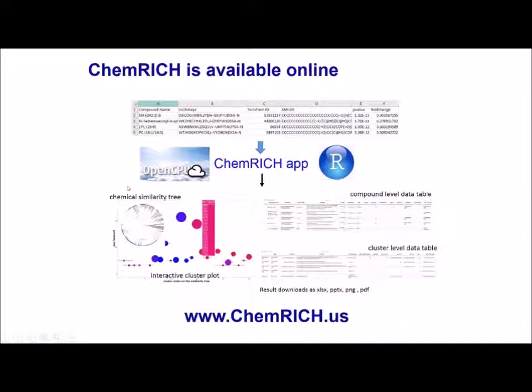Outputs are a tree structure, an interactive cluster plot where you can see what chemicals are inside this cluster. Then we have an interactive compound table and a cluster level table. Results can be downloaded as PowerPoint, XLS, PNG, and PDF formats.